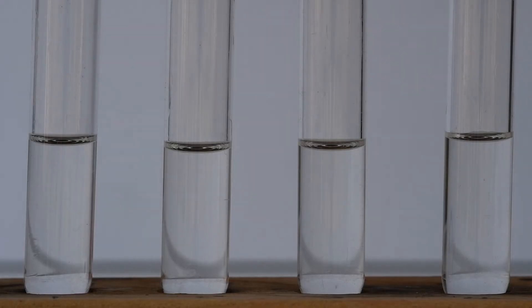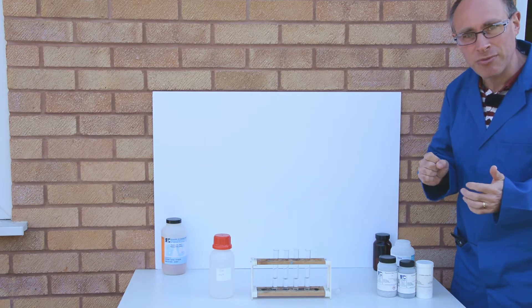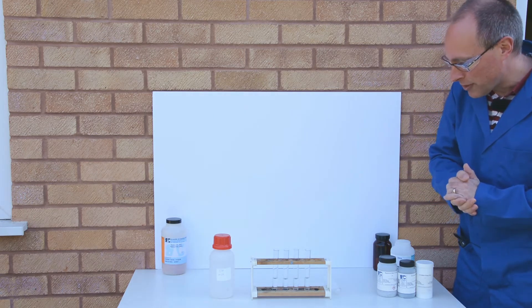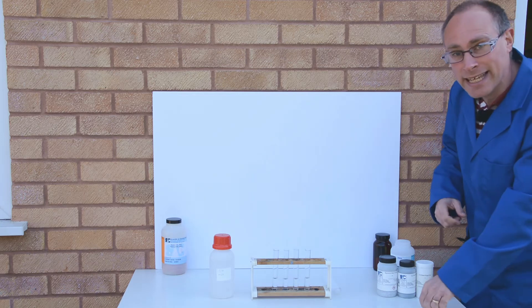So we've got four test tubes, each of them have a small amount of dilute hydrochloric acid, and into each of these test tubes I'm going to place a small amount of a metal and we'll look for any evidence of a chemical reaction.